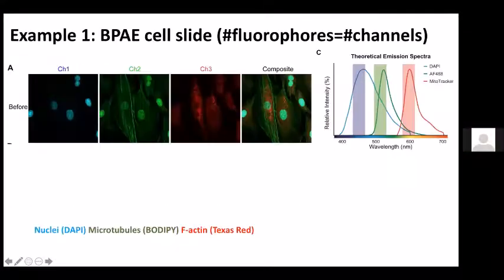Yeah. If we go through the few examples here to show how well the algorithm performs, you may see that we have different cases with different numbers of detectors. I see. Also, later on, I have simulation results that will elaborate on how many total fluorophores we can have, to push the limit. I'll get back to you to make sure this part is answered.